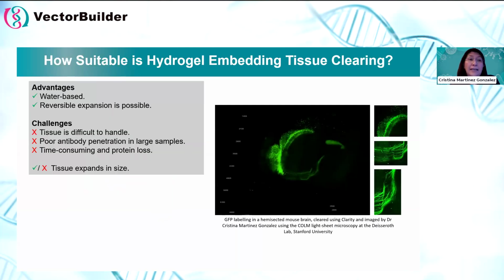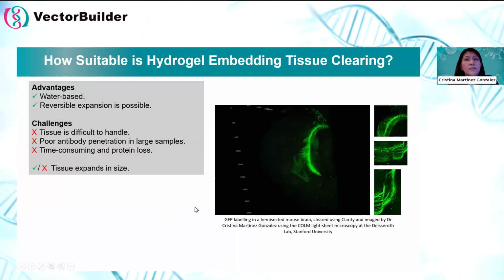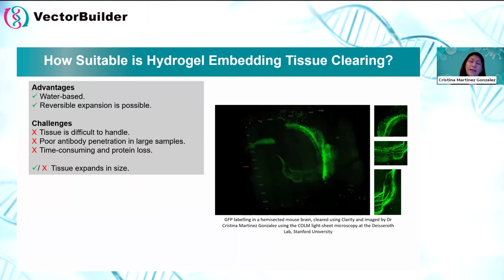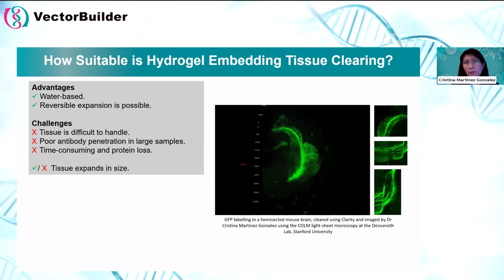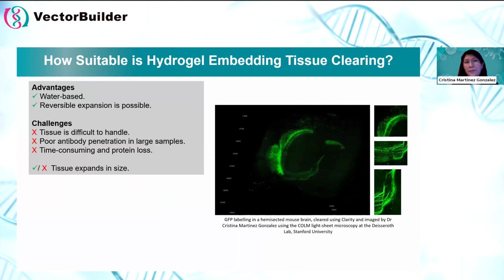It has advantages, of course. For example, being water-based is helpful for many things. However, it's toxic, because acrylamide and bisacrylamide are toxic. Hydrogels are quite toxic in general. Tissue will expand, but it can be reduced.